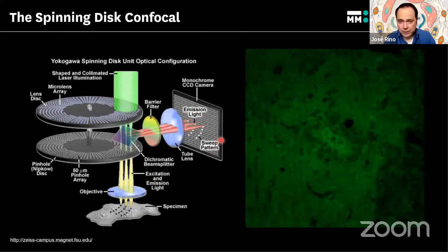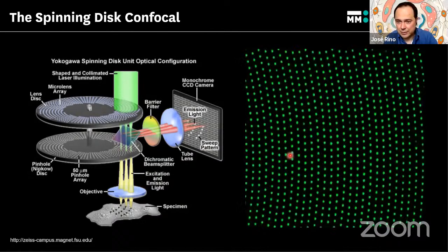So let me show you, actually, this is from one of our spinning disks at the IMM. What I'm going to do is stop the spinning disk, and you'll be able to see the pinholes. It's coming to a stop. You see it's decreasing its velocity. So here it is. This is part of the disk. These are the multiple pinholes along the disk that will excite the sample.